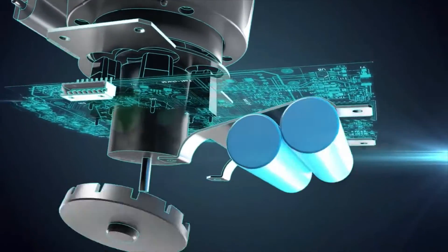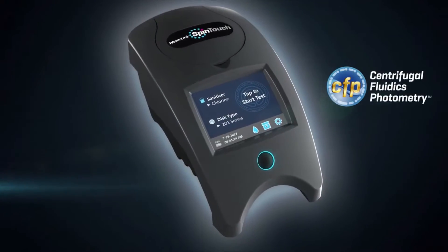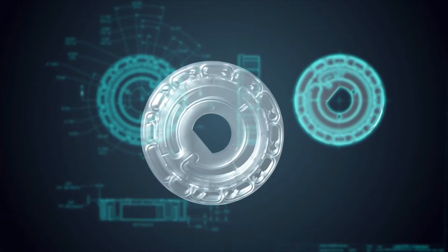Proven analytical chemistry has combined with centrifugal fluidics photometry to create the breakthrough WaterLink Spin Touch. The genius is its reagent disc that simultaneously tests 10 parameters.